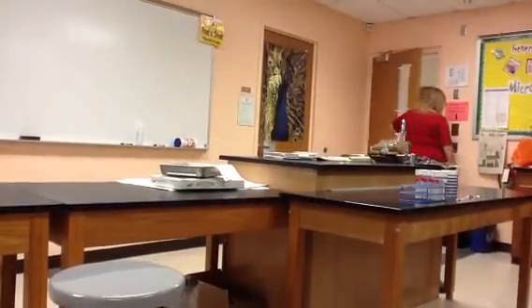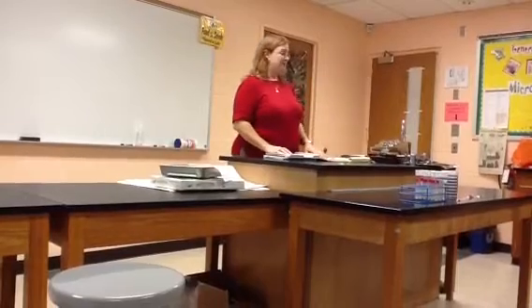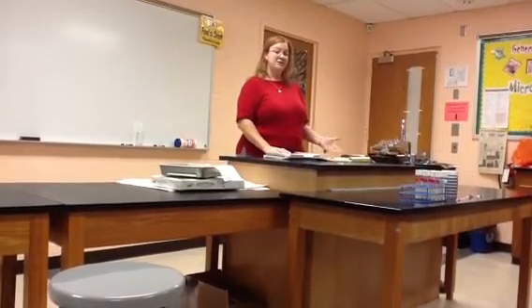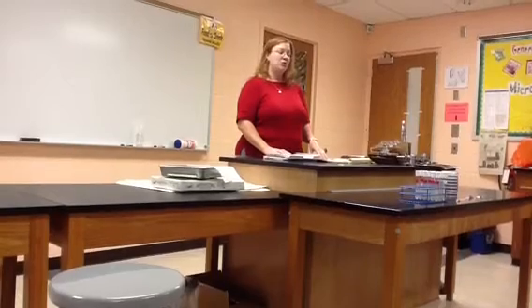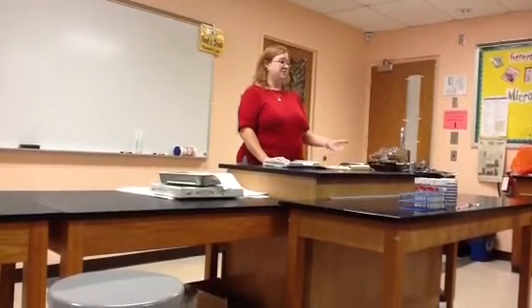We're going to focus instead on identifying bacteria. Right? So if you're working in microbiology in real life, you're in a hospital lab, a health department lab, something like that, where you've got a sick patient who maybe has diarrhea or some other condition, and you're trying to figure out what's making them sick. Right? So you get a sample from the patient. It's always a mixed culture. Whether you're getting a sample swab from the back of somebody's throat who the doctor suspects has strep, or you're getting a fecal sample to figure out what the problem is with diarrhea, there's always a mixed culture of lots of different kinds of bacteria in it.